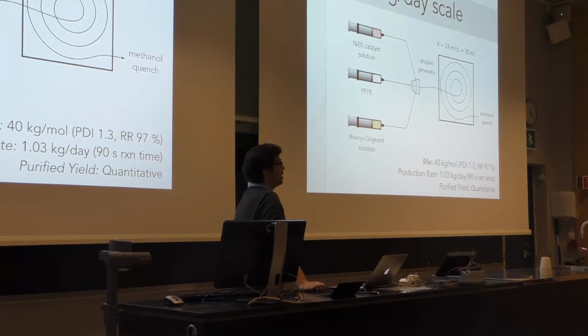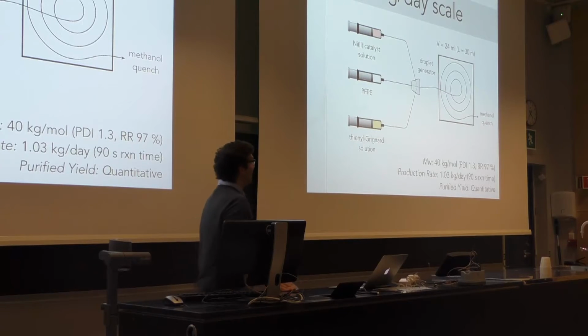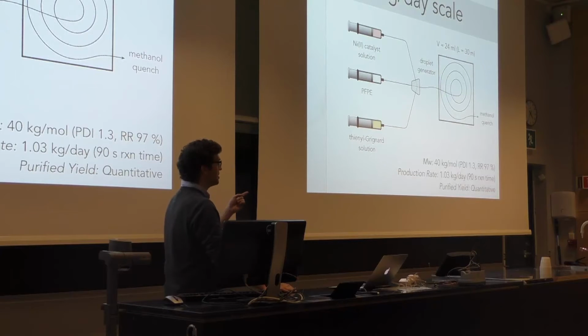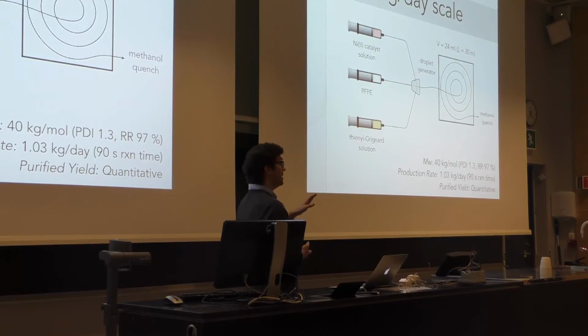Okay. And compared with the other synthetic techniques you can find for P3HT, what is the advantage of your technique? Can you summarize? There are a few other ways to synthesize P3HT, right? There's direct arylation. You can do it using Stille if you want, but you wouldn't want to do that at large scale. You can probably do it using Suzuki as well. I think the advantage with this is the simplicity of the synthesis, because although there might be a few steps in doing the brominations, just using the Grignard reagent, which is an off-the-shelf reagent, it's not a fussy reaction, and it gives you very good control over the molecular weight. We're taking advantage of that linear relationship between molecular weight and the reciprocal of nickel concentration quite a lot. But you can do it in other ways. I just don't think it's as scalable.